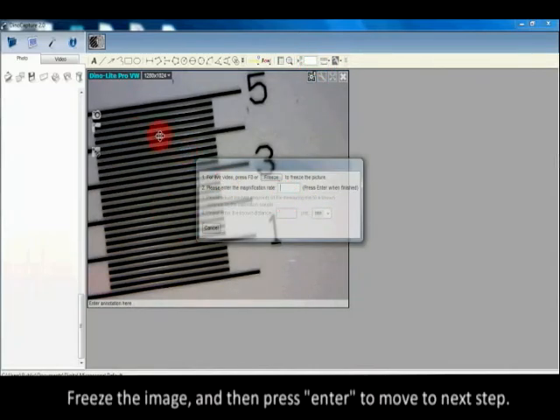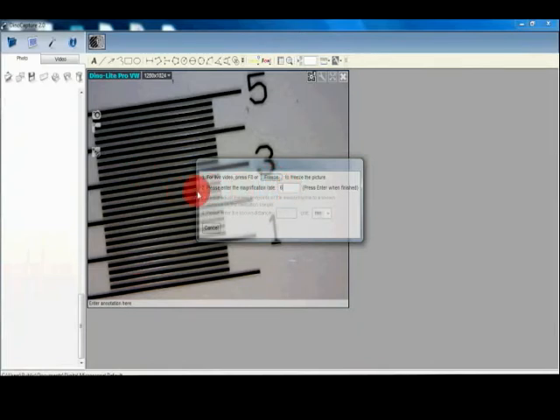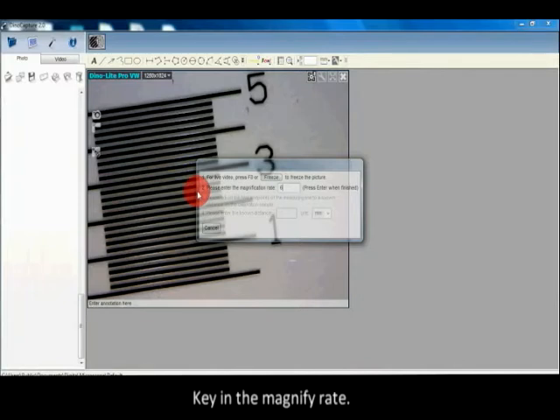Freeze the image and then press enter to move to the next step. Key in the magnification rate.